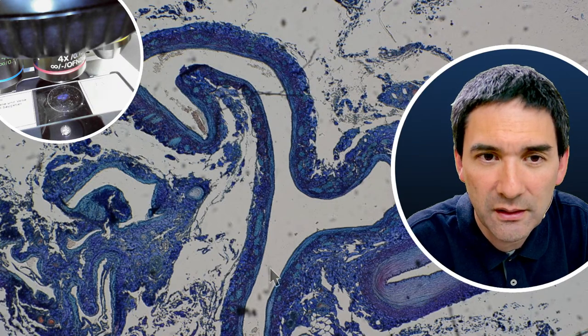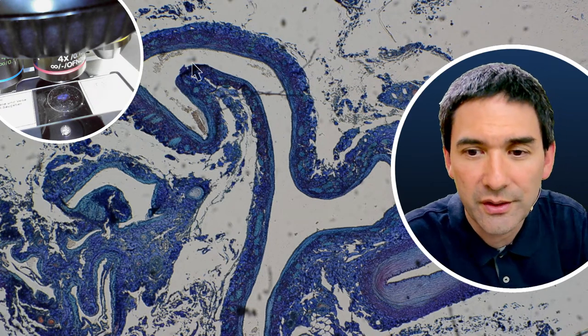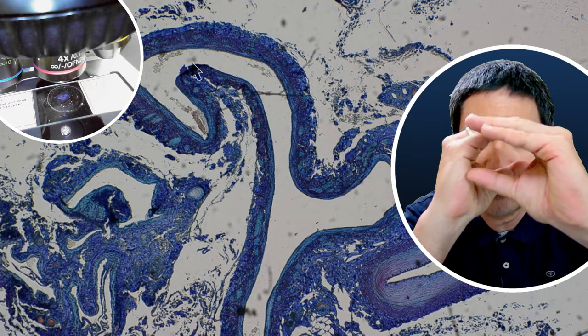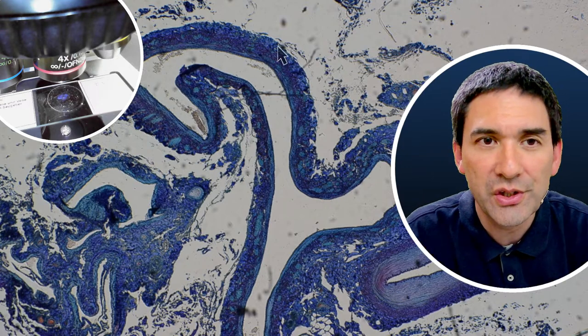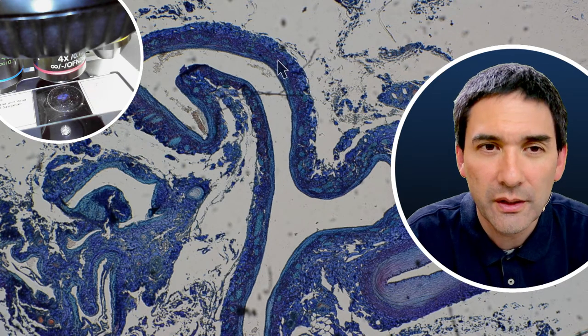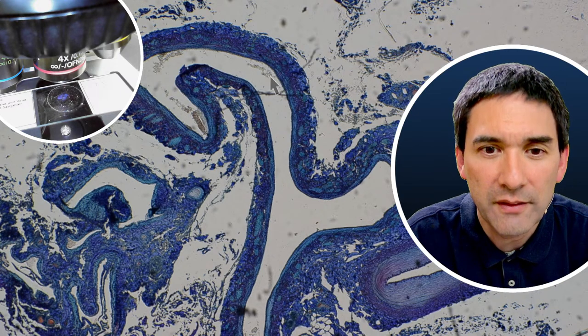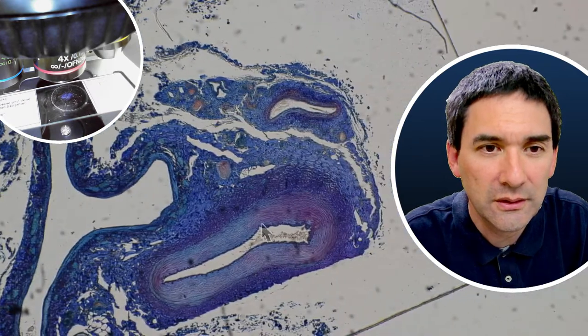is a blood vessel. This is the vein, and it's pressed together. So basically, if it's the vein, it's kind of pressed together, like flat. This also shows that the vein has a very thin wall on the side. It's very thin because the blood has a low blood pressure, so there is basically no need to have a thick wall. Here, for example, you need to have a thick wall. So let's have a look.